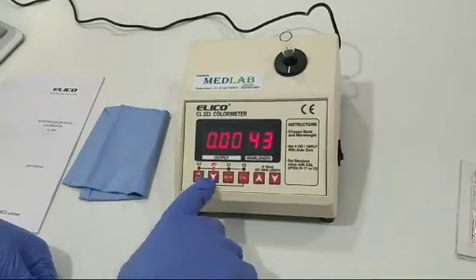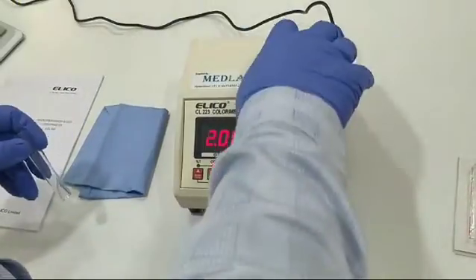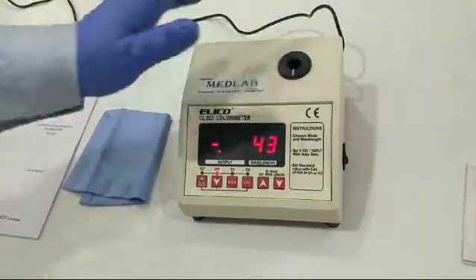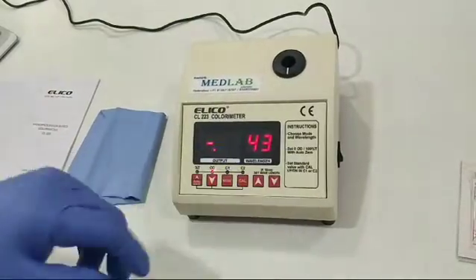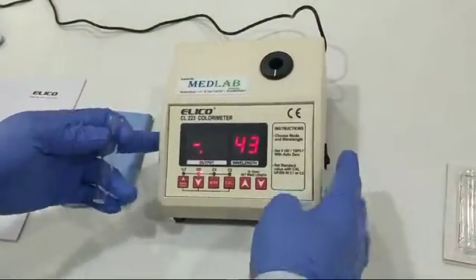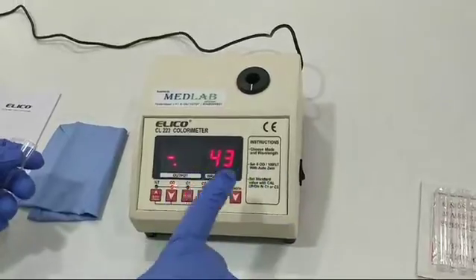Then you click on mode option, and whatever sample you insert, the reading will come. That reading will give you the measurement for 430nm. That's all about the Elico colorimeter, but it is not recommended to buy this product.